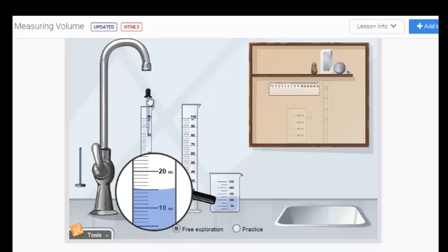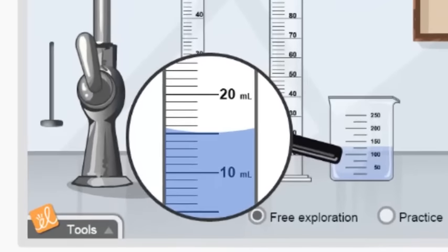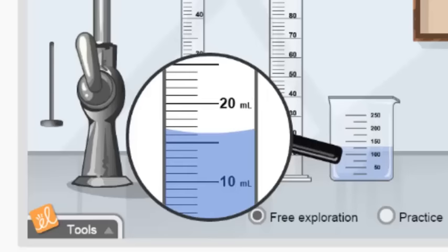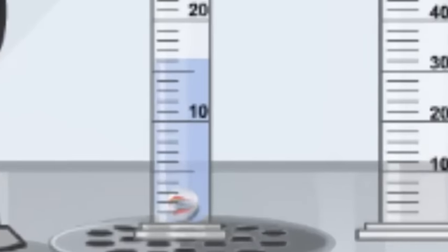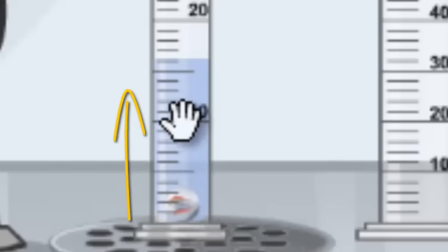Now if I gave you an object and asked you to find the volume of it, what you want to do is take the object and place it in the graduated cylinder. Before you do that you should write down your starting point. Since we have 15 milliliters here we'll use that as our starting point. Then I'm going to take an object and drop it in the graduated cylinder. So I'll just grab this marble and drop it in and watch the level of the water after the marble hits the bottom. If you take a look here you'll notice that the level of the water has actually changed. It was down to 15 and now the meniscus has moved up to 16. That's how we can find the volume of this marble because what it's done is displaced or pushed water up into the graduated cylinder, causing the water level to rise.